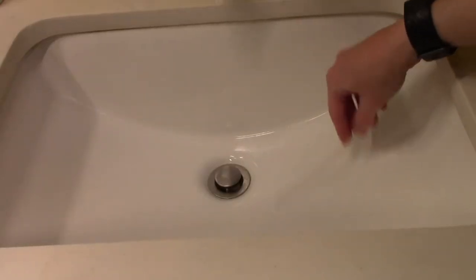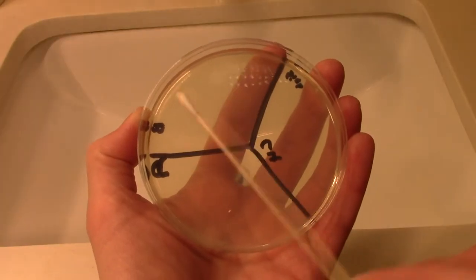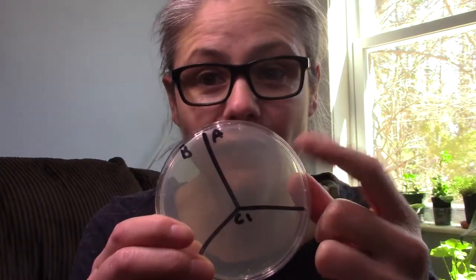I'm going to swab an area that I want to test — for example, the bathroom sink — and put that sample in B for before. Then I'm just going to spray with the Microband and let it air dry. Once it's air dried, I will swab again and put that sample in A for after. C is our control — I don't put anything there.